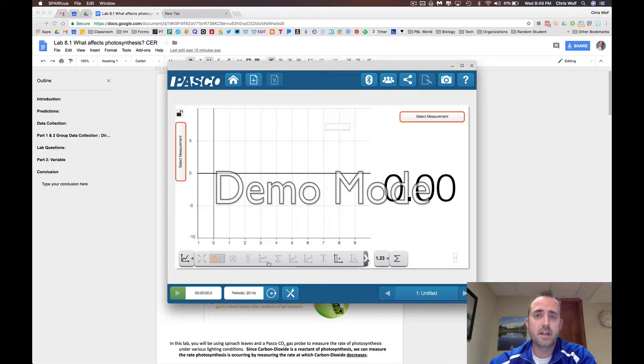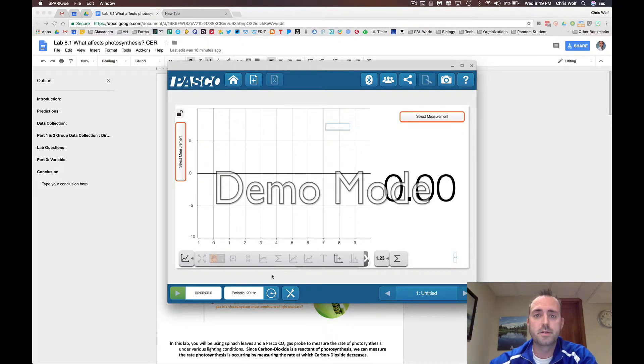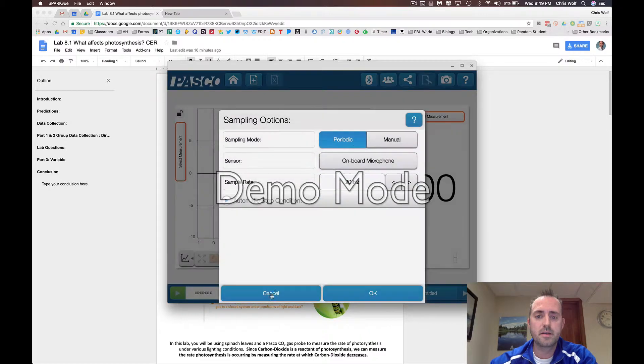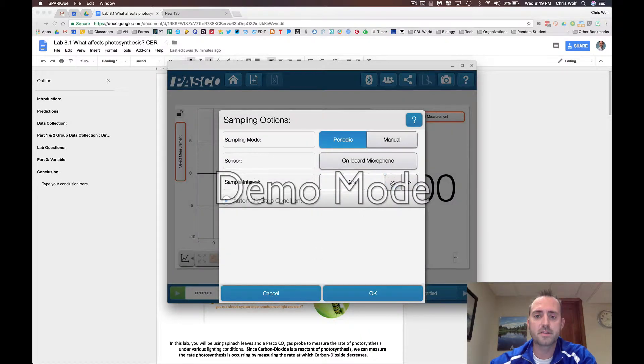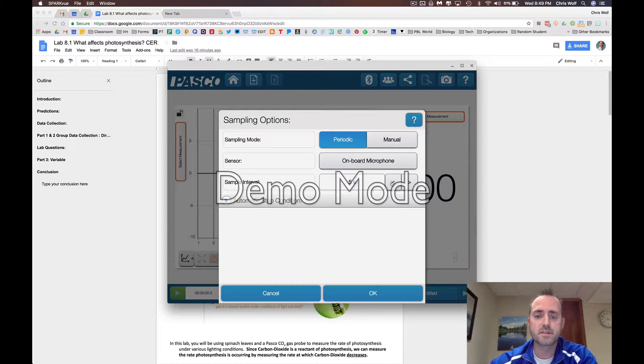We also need to set how often the CO2 sensor will be taking recordings from this lab. To do that, go down to the sampling options under this icon and change this down to 2 to 5 seconds. I recommend 5 seconds.